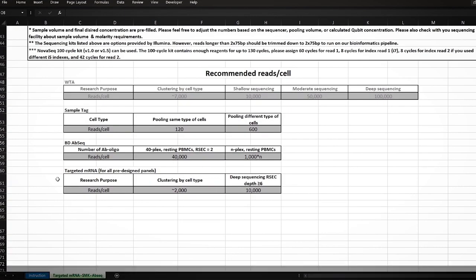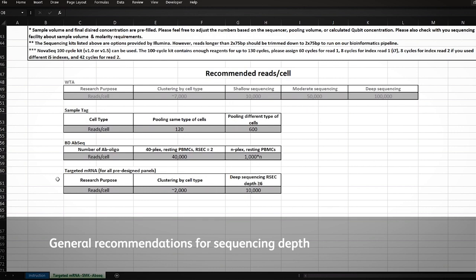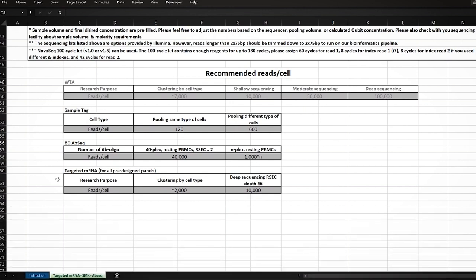The sequencing calculator includes general recommendations for sequencing depth at the bottom of the page. Please consult with a local field application scientist or contact the Multiomics Help Desk if you have questions on sequencing depth.